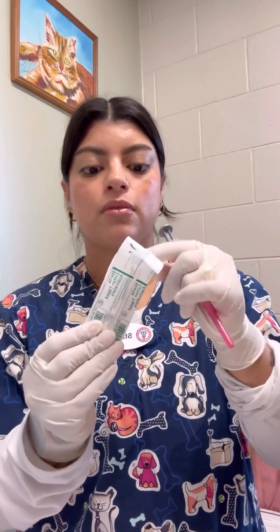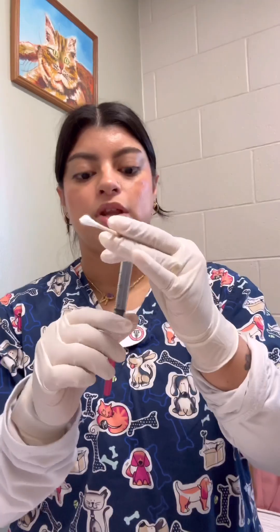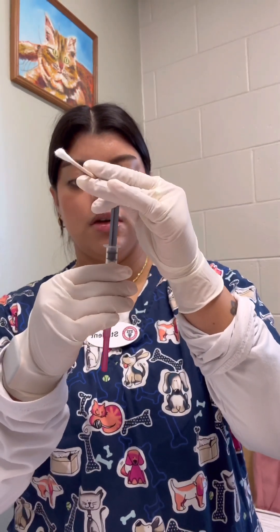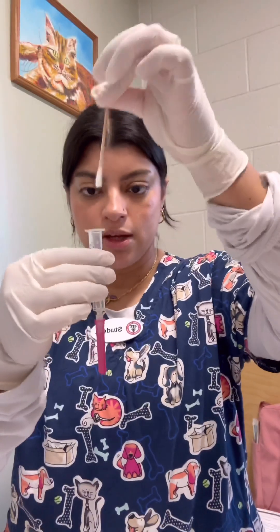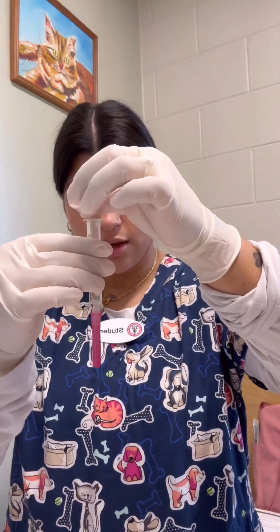I'm going to use the sterile swab, opening that up and taking one of the swabs. I'm going to open the top of my syringe, then put the swab into the syringe and mix it for a couple of seconds.